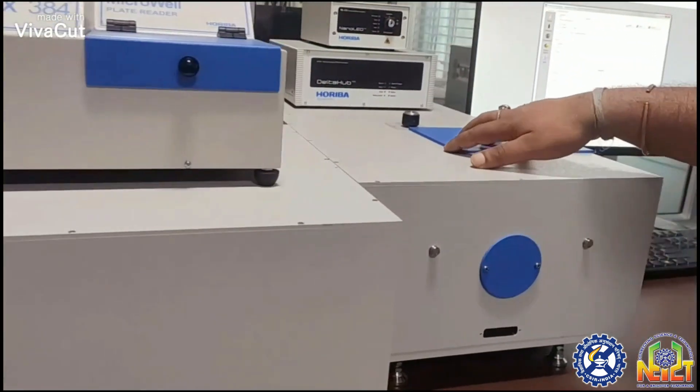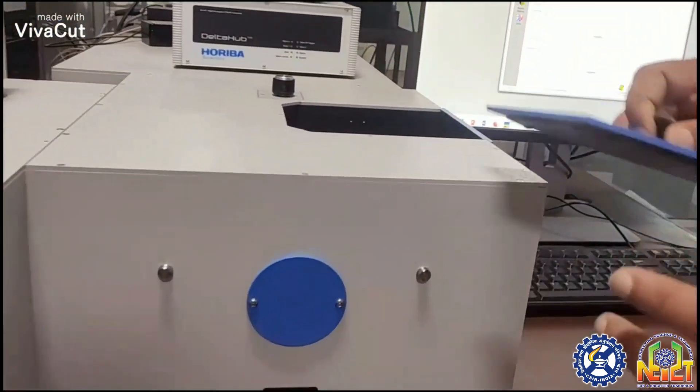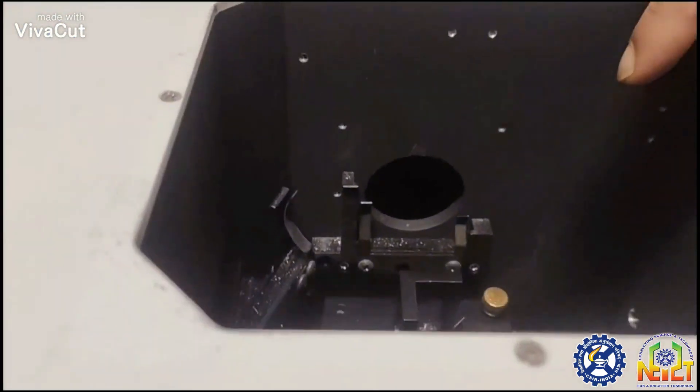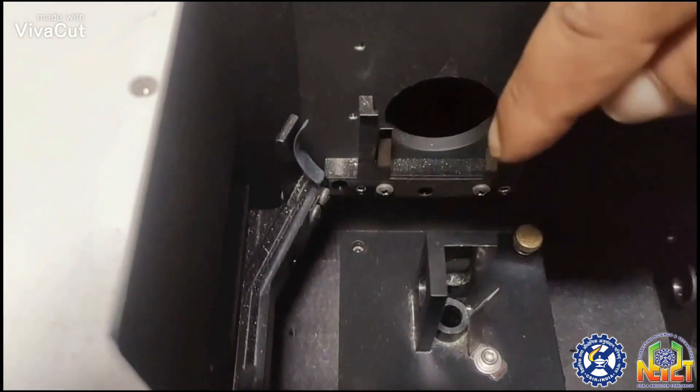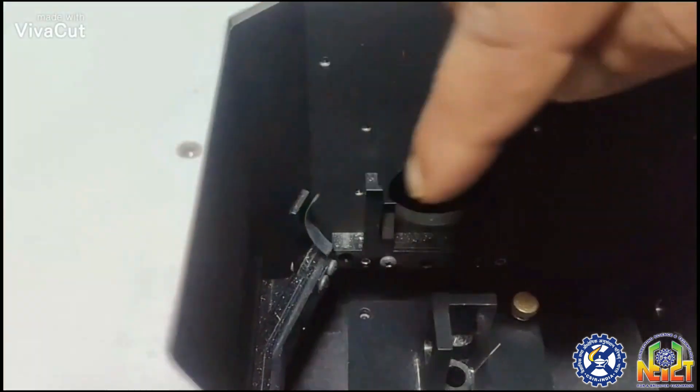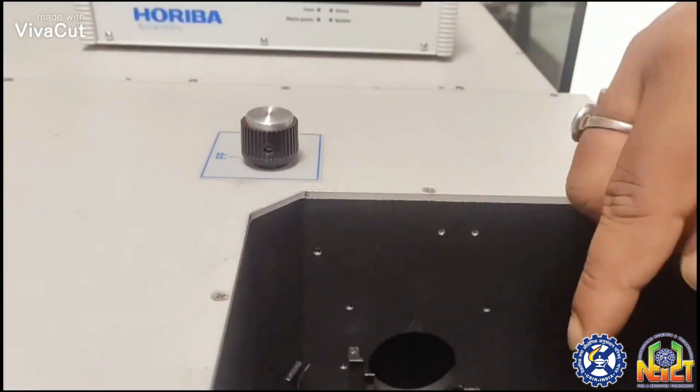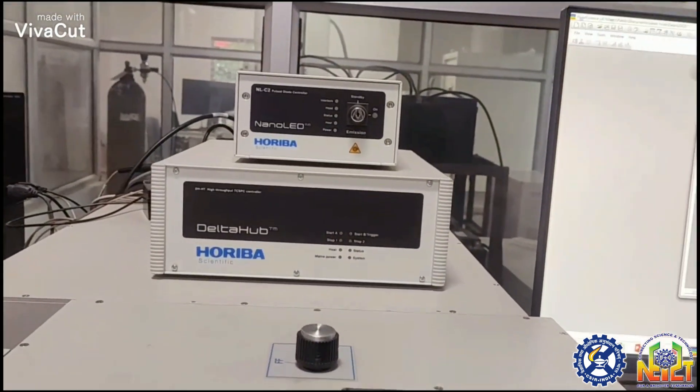This is the sample compartment where you place the cuvette with your compound. This is the input side and this is the output side. Light enters from the input, passes through the sample, and exits to be analyzed at the detector.